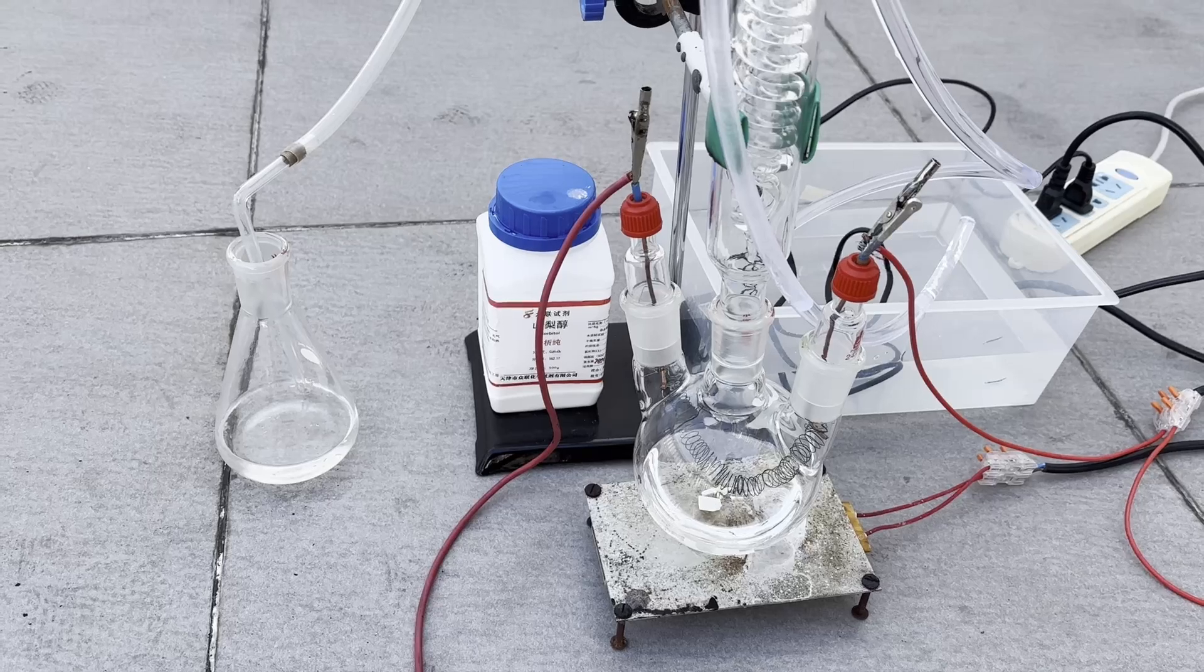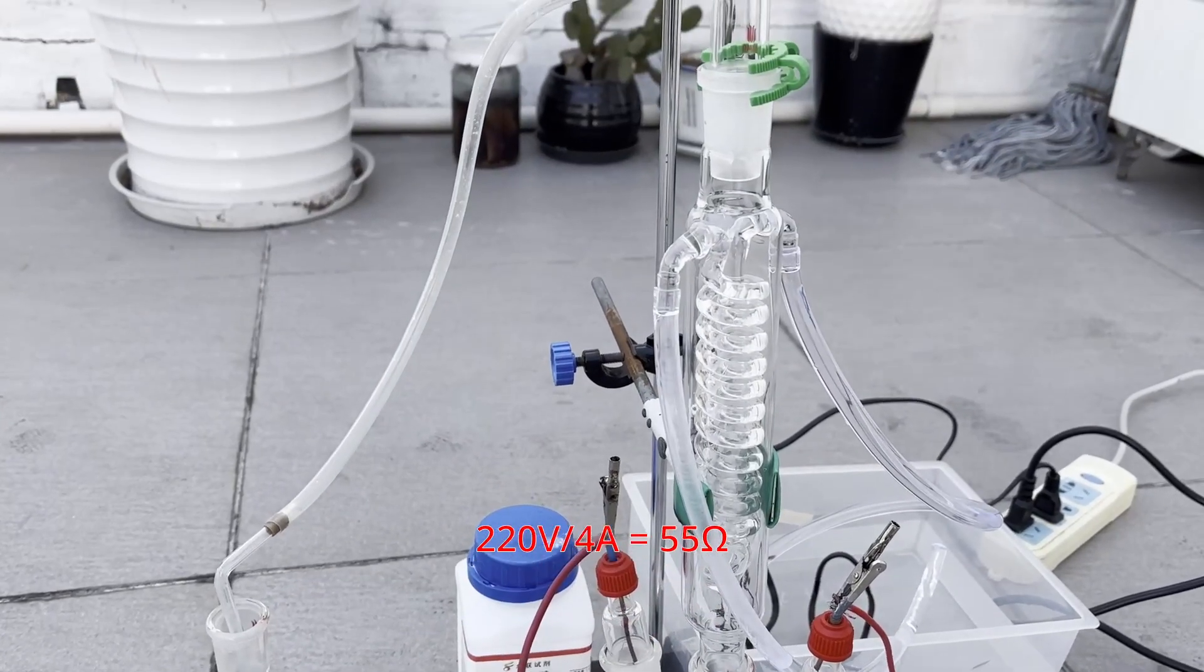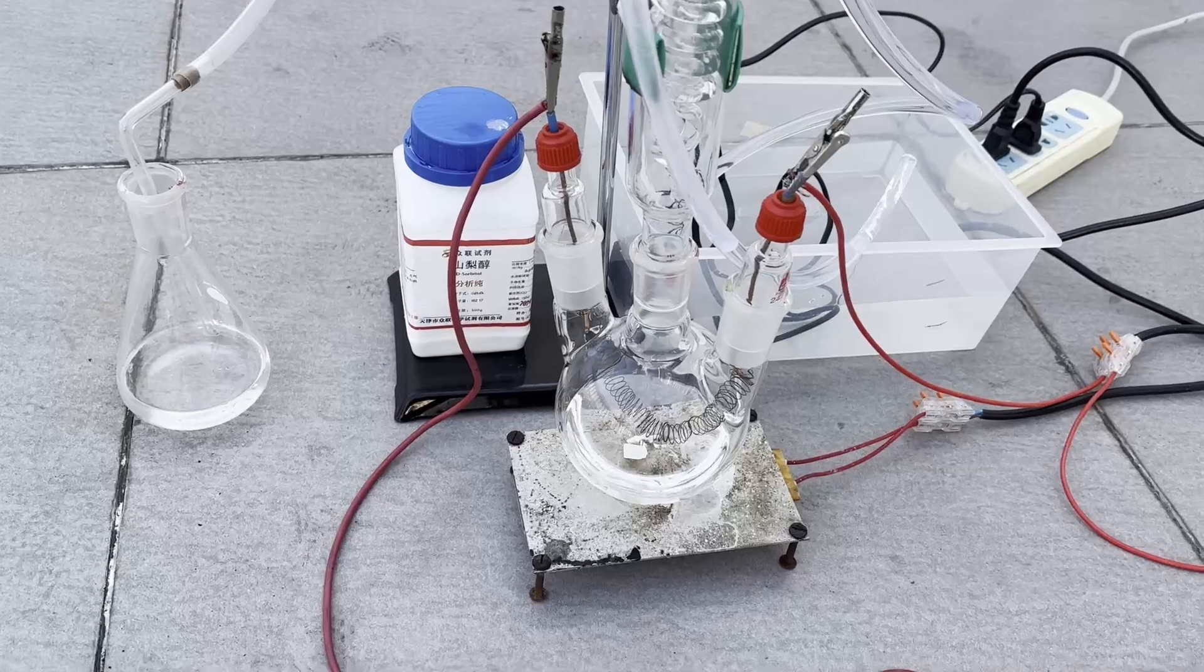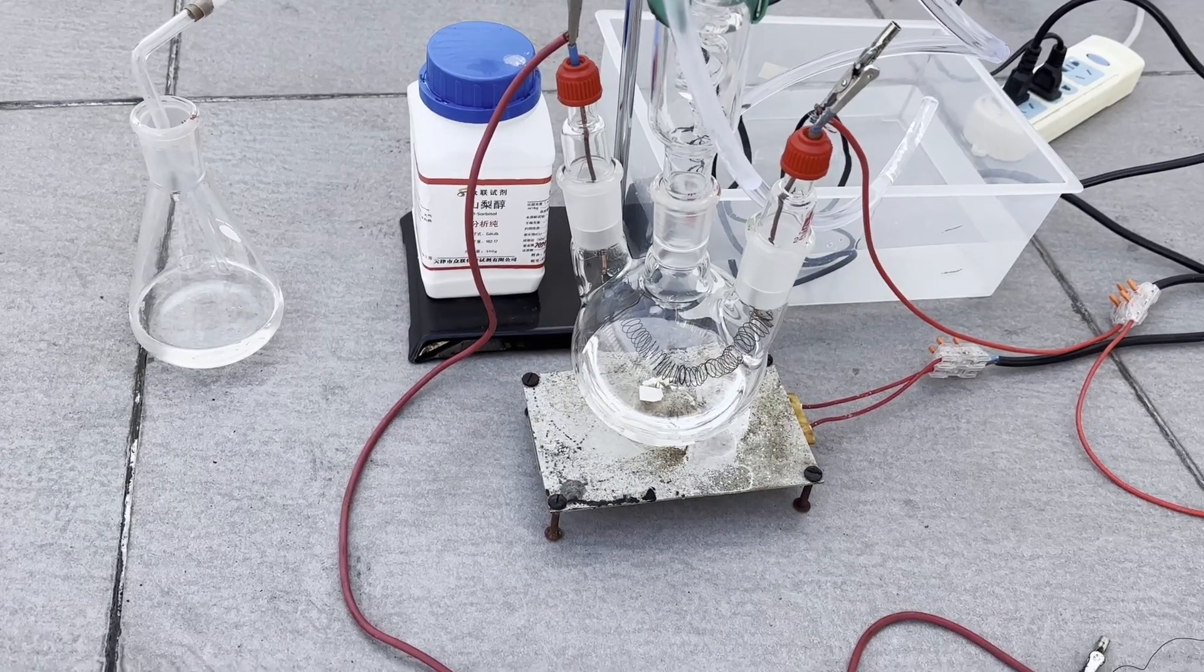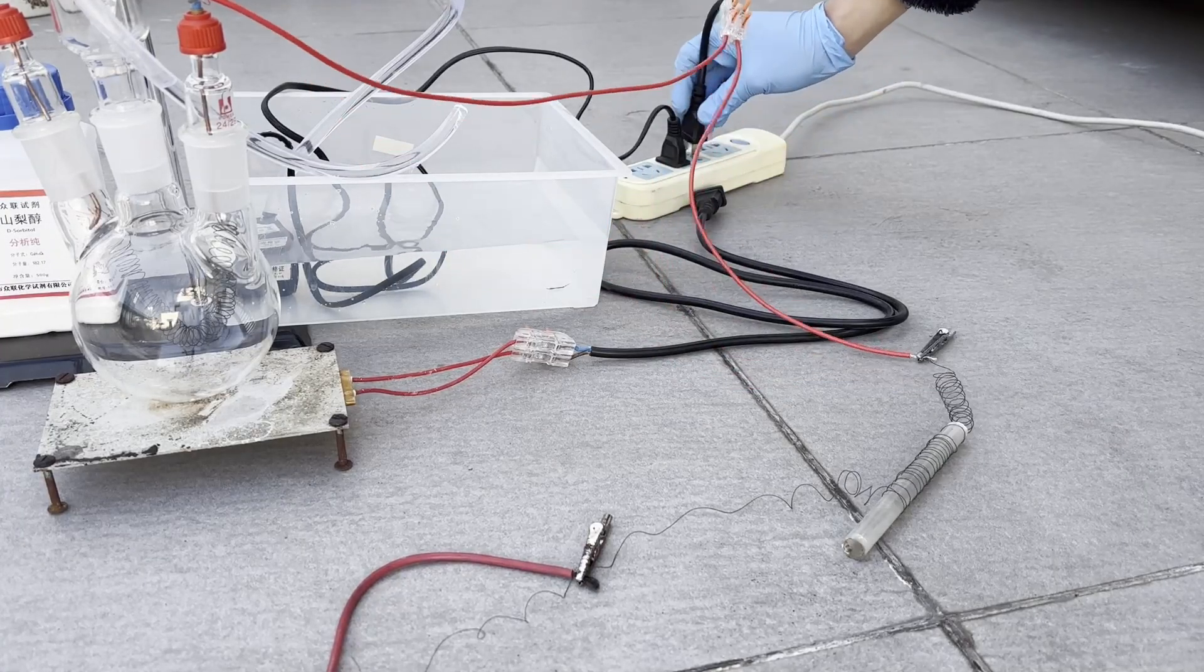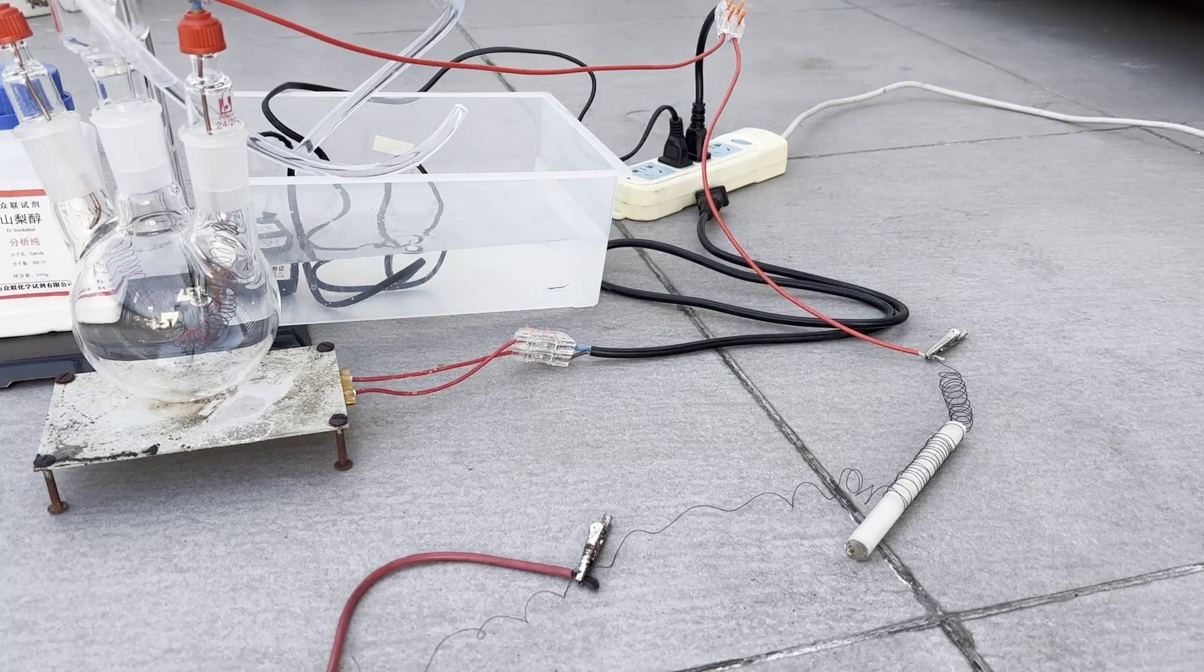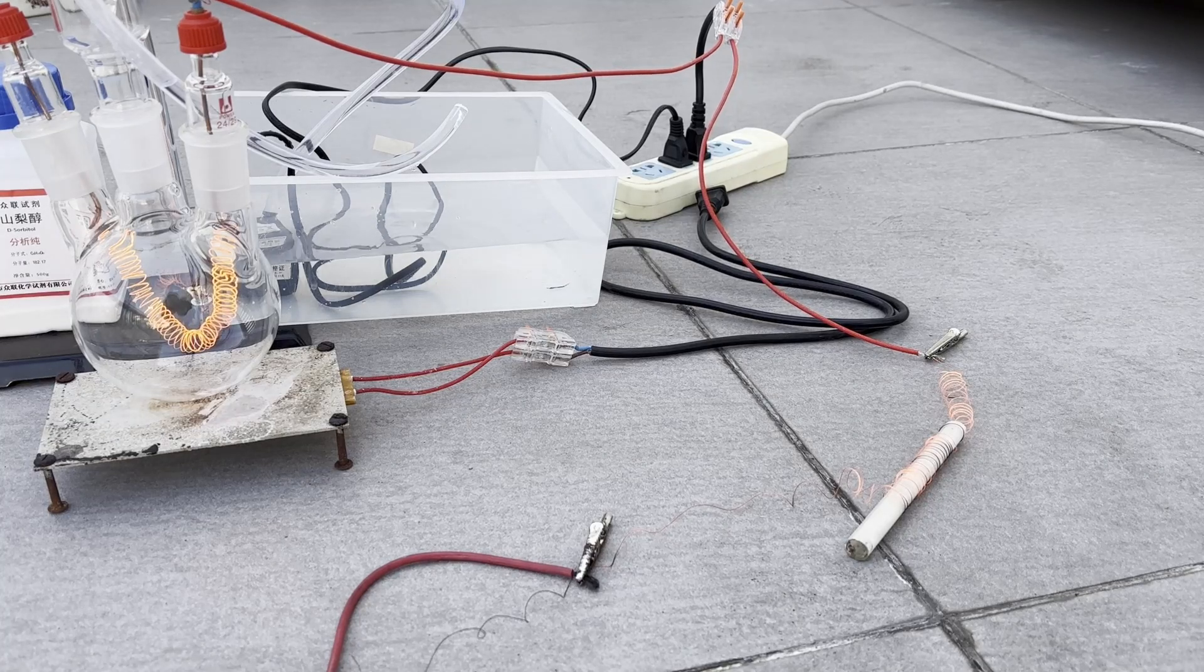The target current we want is 4A, so the resistance we need is 220V divided by 4A which is 55 ohms, which roughly corresponds to the resistance of 4 meters of the wire. So I winded up another 2 meter coil to act as an additional resistance, and connected the two coils in series. And yes, the coils glowed very nicely. We finally had high enough power to efficiently pyrolyze the acetone.